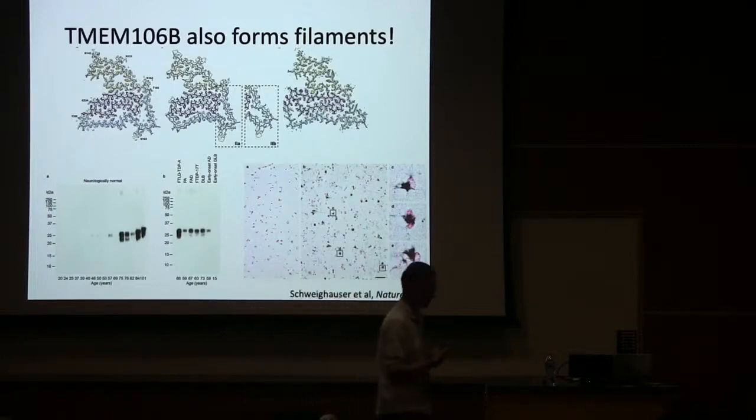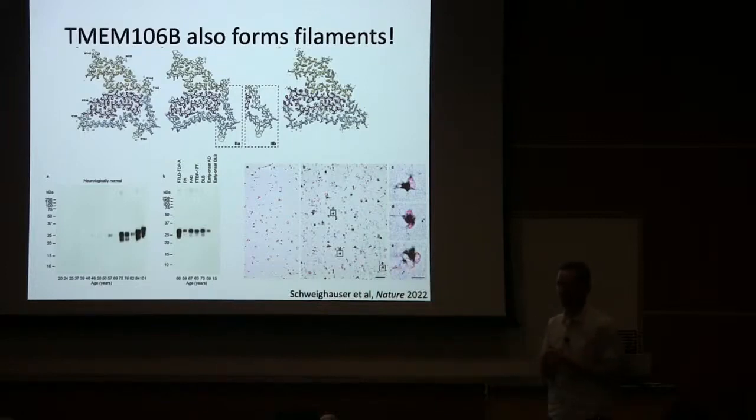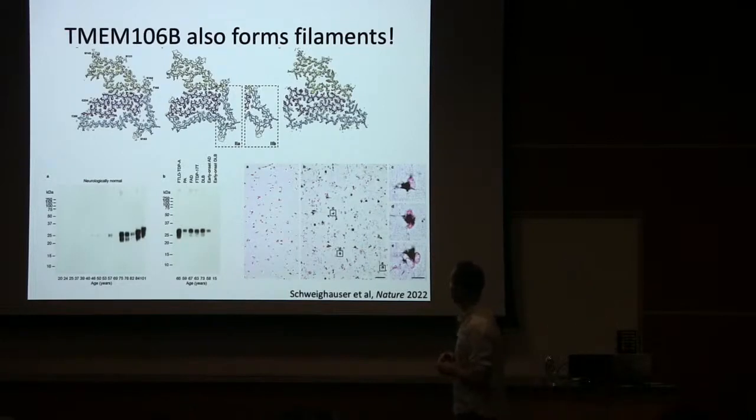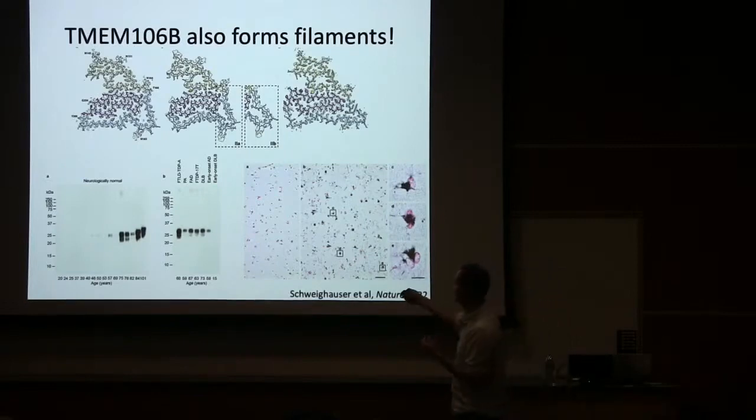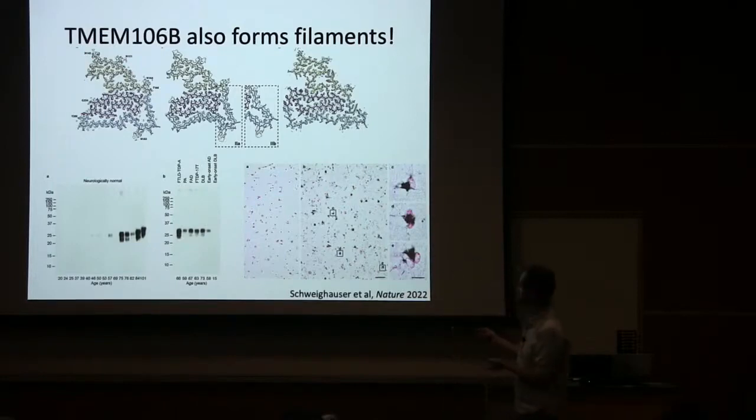It wasn't until Alexei Murzin, who is our walking protein structure encyclopedia in the lab. Alexei developed the SCOP database for classification of protein structures, perhaps some of you know, and he's seen many protein structures. He read a paper about this transmembrane protein called TMEM106B, and he recognized there were 4 glycosylation sites. He had already recognized previously that there were 4 different glycosylation sites on these filaments just from looking at the density, and then it all clicked together, and he could build the atomic model of TMEM106B straight into the map.